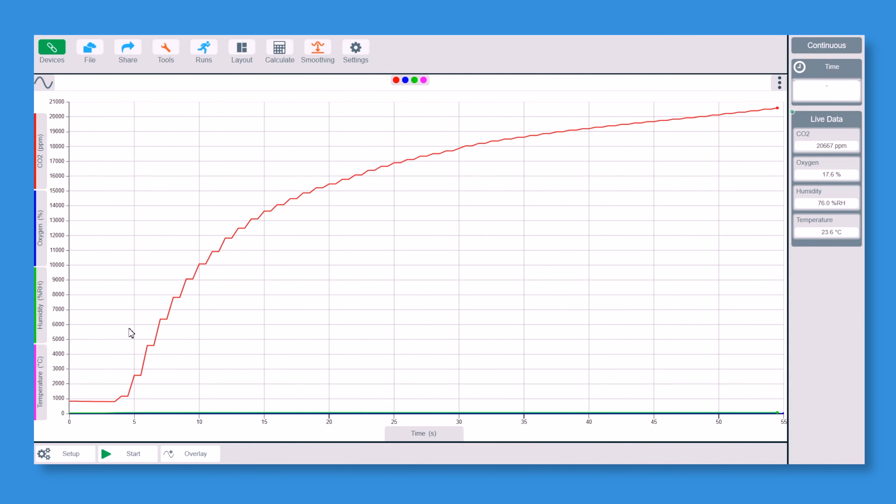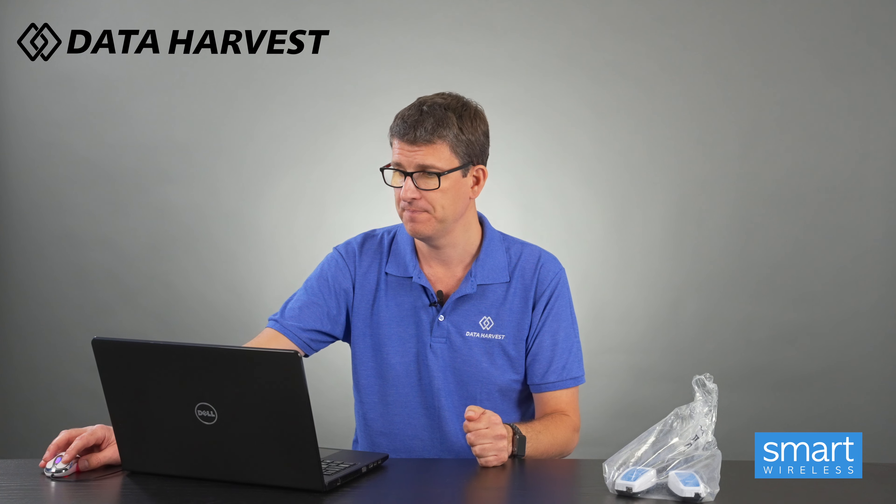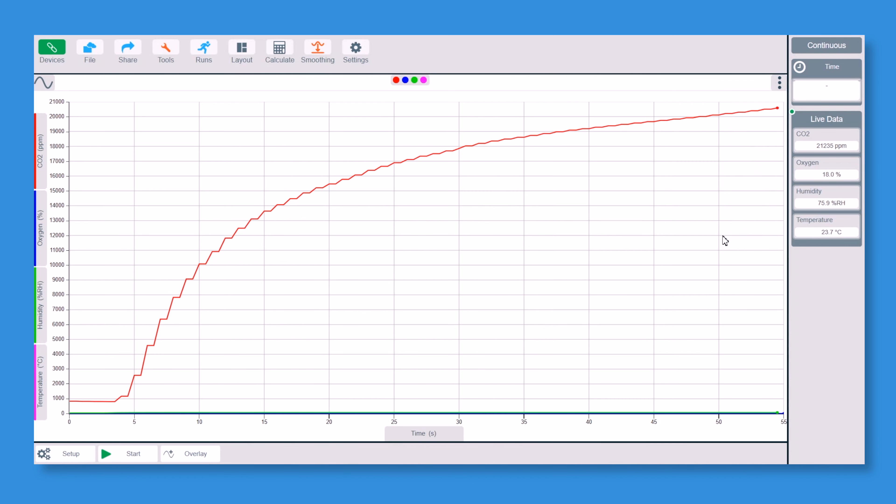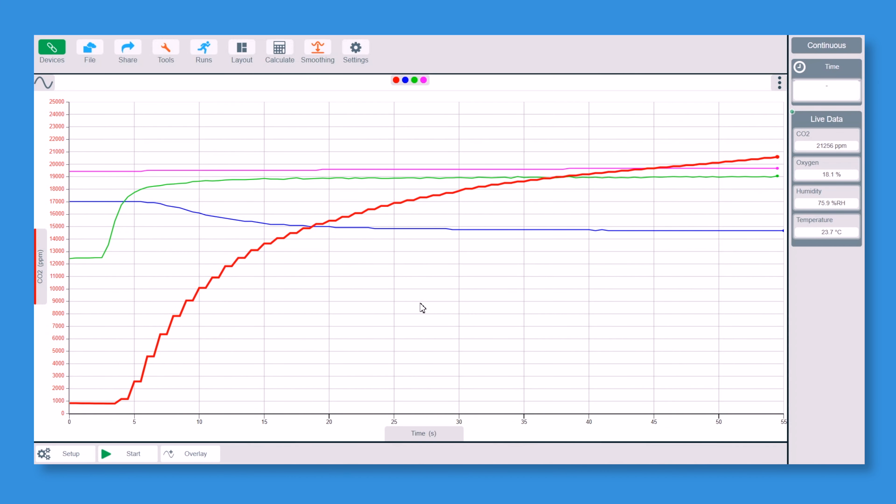Now we don't know in the software exactly what you're going to be using together, so we put an axis on the left. Now there's a couple of things we can do. We can go to our local tools on here and we can have the multi-scale, so that works an absolute treat.